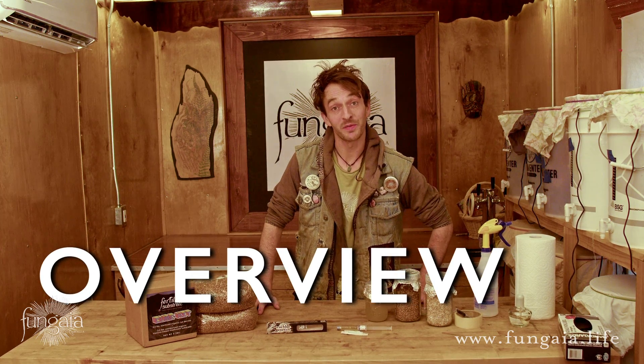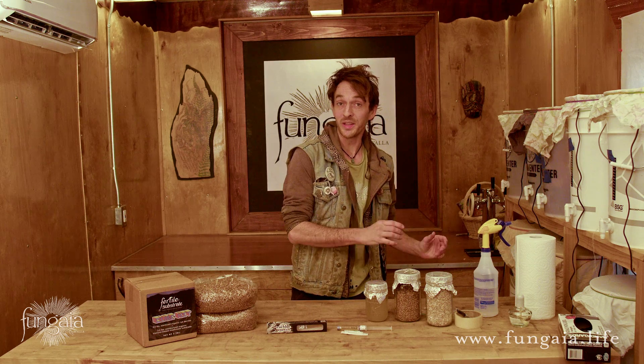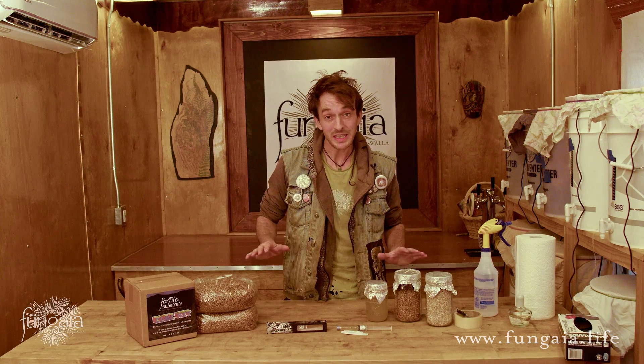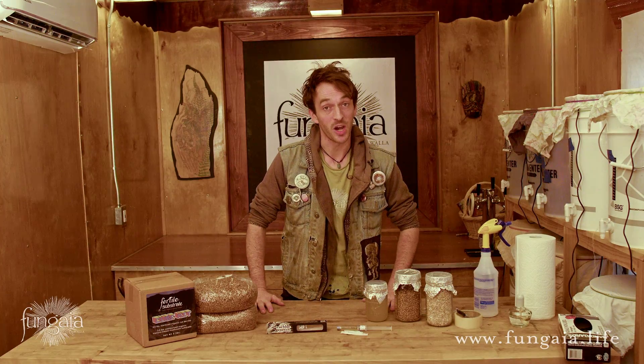Mushrooms thrive in the same environment as many other organisms like bacteria, yeast, and mold. So if we're not careful, we'll start out trying to grow one type of fungus and end up growing another. This is why we begin growing mushrooms in a completely sterile environment so that the mycelium can begin building some biomass before having to deal with any competition.